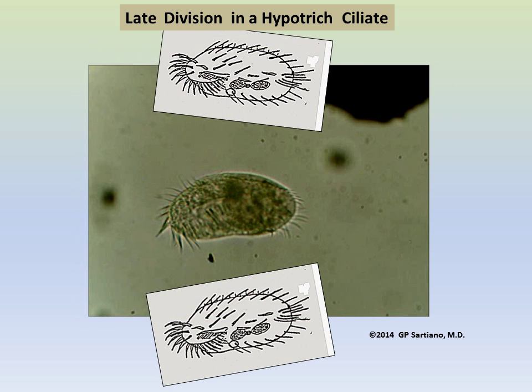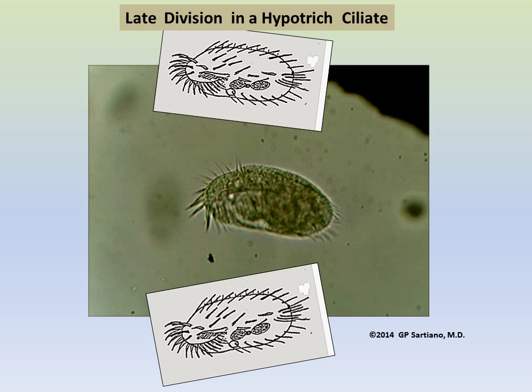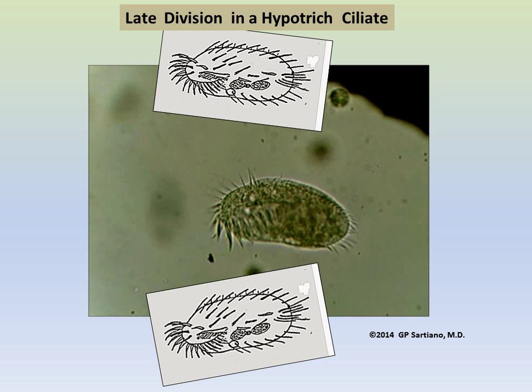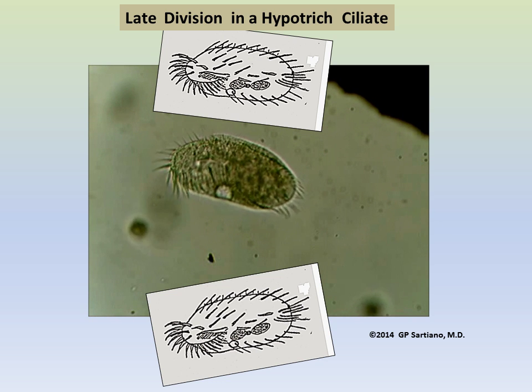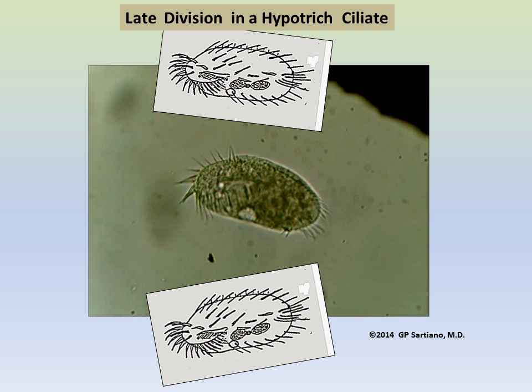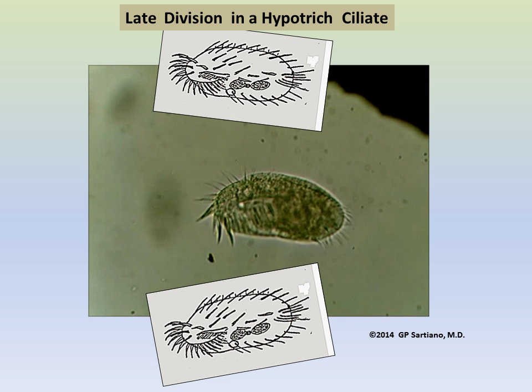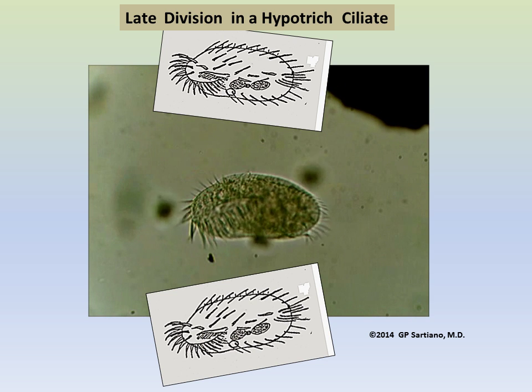This is one of the two product cells under higher magnification. The two inset diagrams from Kahl illustrate the coarse, stylus-like anterior cirri, the cirri of the lapel, the finer posterior cirri and cilia, the cytopharynx, the nuclear lobes, and the contractile vacuole, all of which are quite comparably seen in the video, which is playing on a loop.